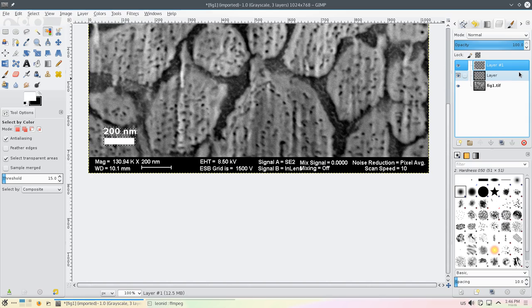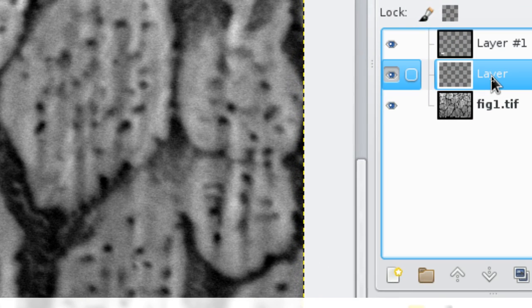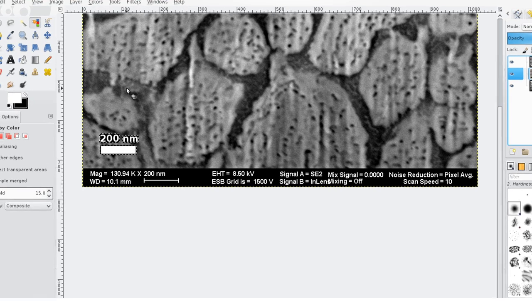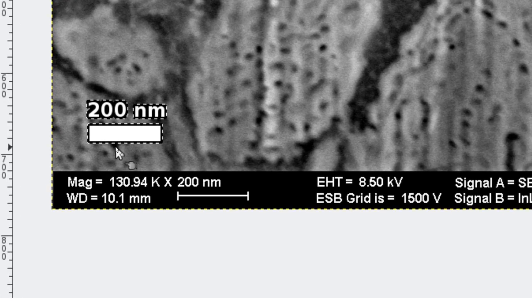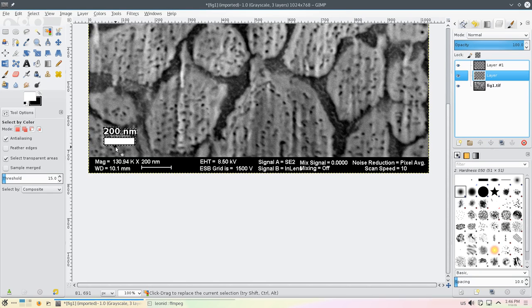We choose the layer beneath it. We go to the layer beneath it, to the bottom layer. We'll just press on it. Sorry, not the bottom layer, the middle layer. And now when we do Ctrl dot, we see that it works correctly. Let me enlarge it. We see that indeed we have the background underneath the text, but it still doesn't look so good.